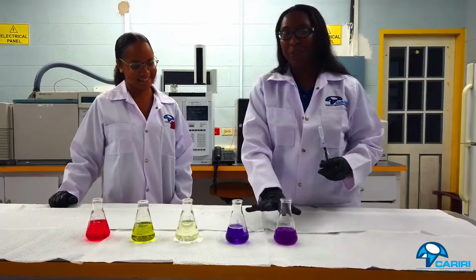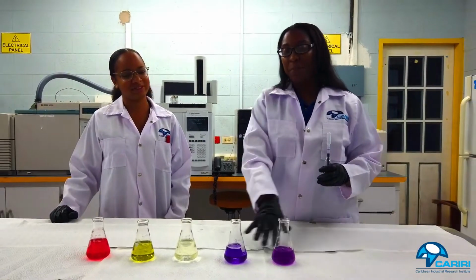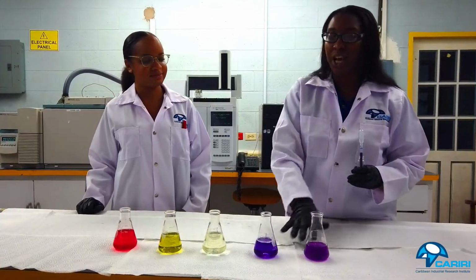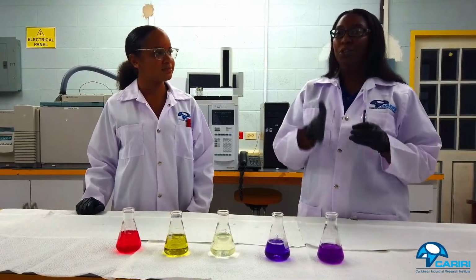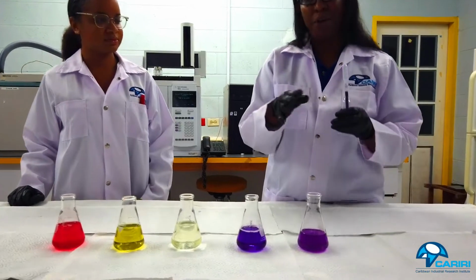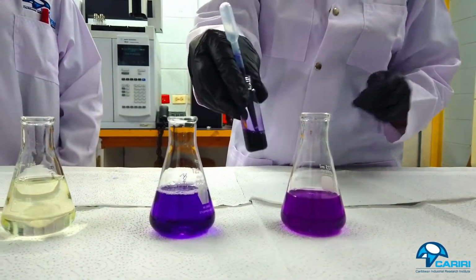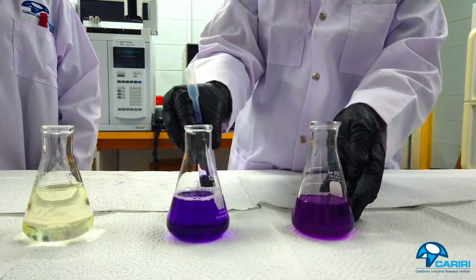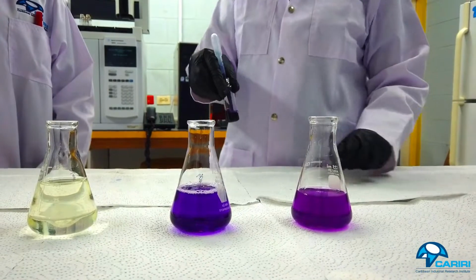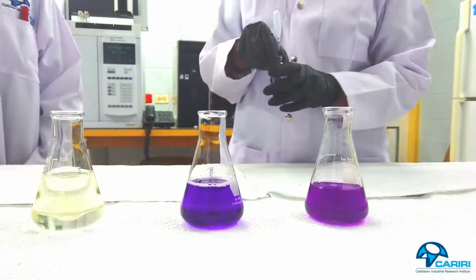Alright, so the solution in 2 of our conical flasks remain purple. Now what that tells us is these solutions are close to the neutral part of the pH scale. So it means that they more or less stay the same color as the indicator. Now they're not looking as dark as this because obviously it's diluted, it's in a larger volume of liquid, but it remains very close to the original indicator color.